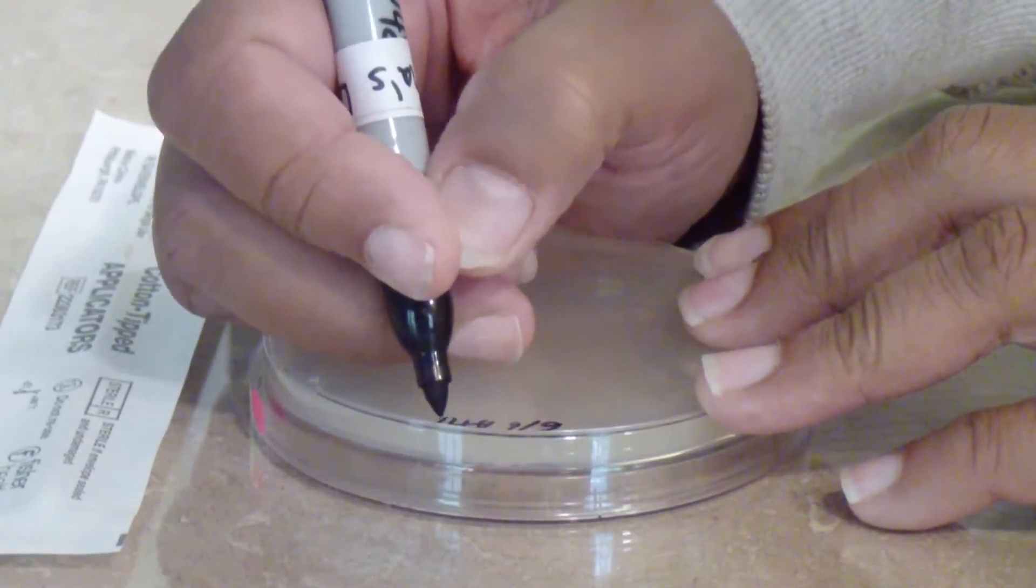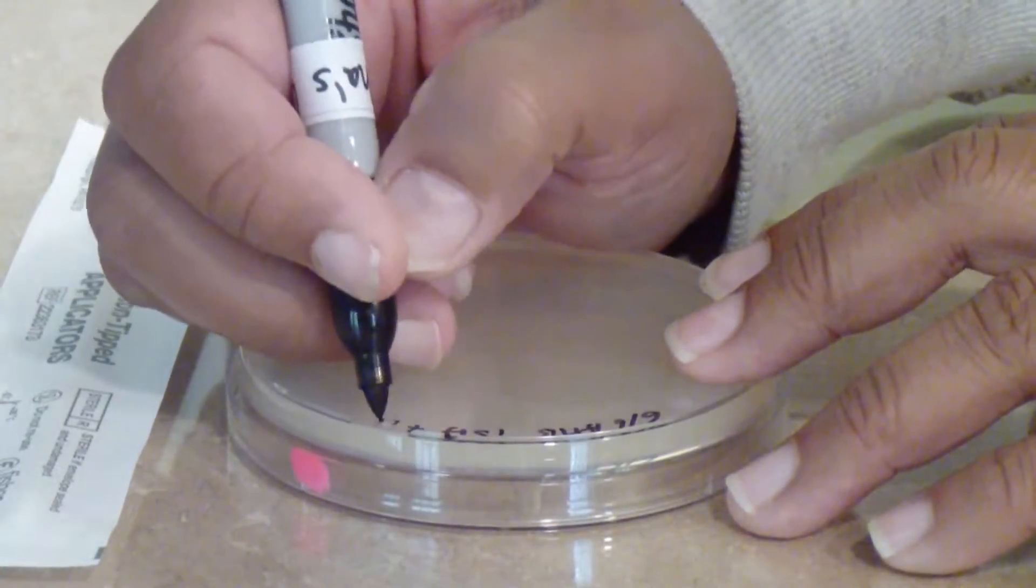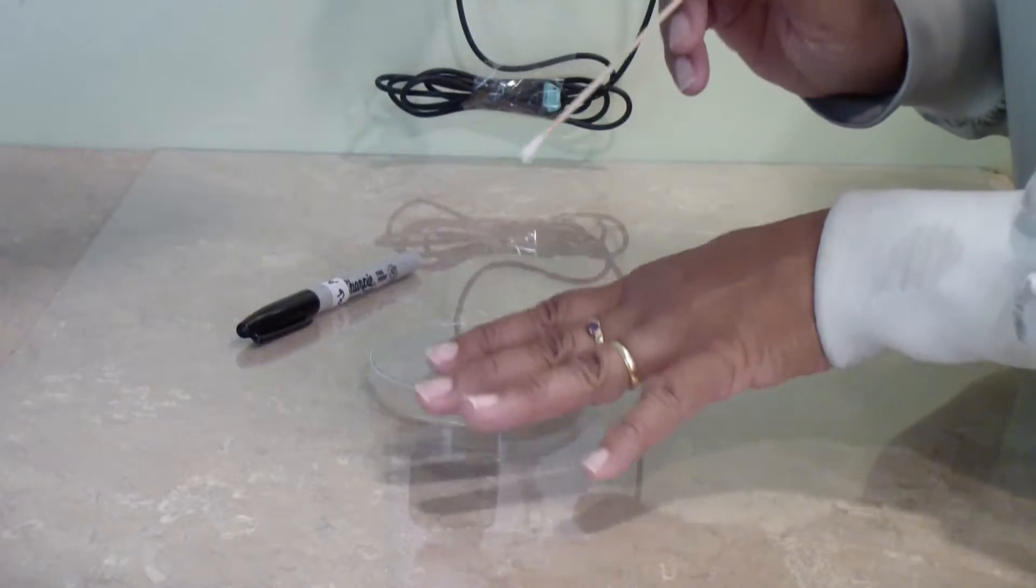You will need a cotton swab and a labeled TSA plate. Moisten the cotton swab with regular tap water. Then rub it over the surface you would like to sample.